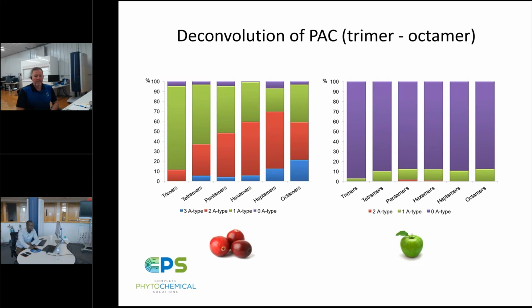What classes of polyphenols could be used as markers for authentication? Okay, so we have also looked at hydrolyzable tannins or ellagitannins to support the authenticity of pomegranate ingredients, juices, and foods. Anthocyanins, the pigments of botanicals, are also well suited for MALDI. They are naturally charged species and fly as the mass themselves. They don't need to pick up another ion adduct. Flavonols and flavonol glycosides are also detectable by MALDI. So there's a lot of variation in targets that we can go after when we look at data for substantiation of authenticity.